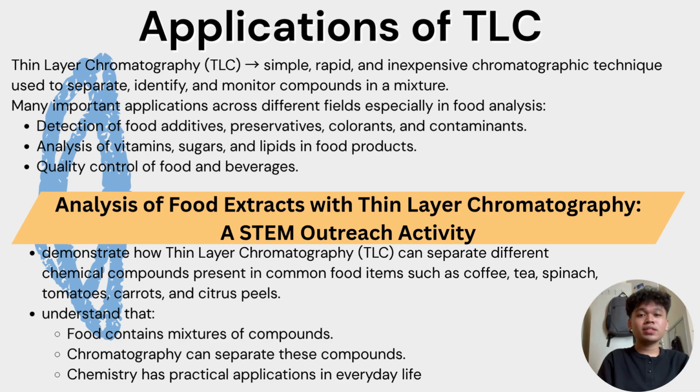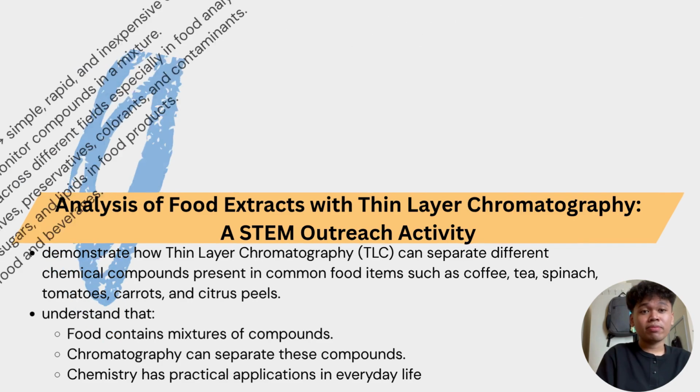The researcher wanted us to understand that food contains a mixture of compounds. Chromatography can separate these compounds. Chemistry has practical applications in everyday life.